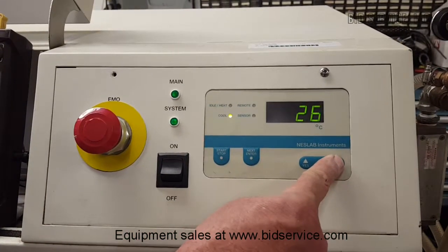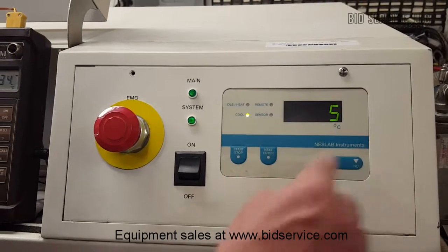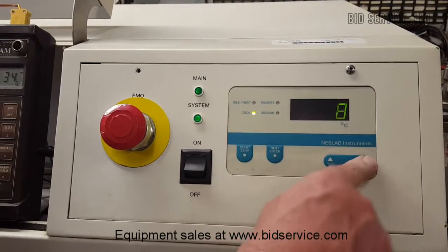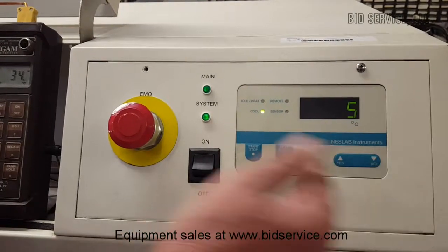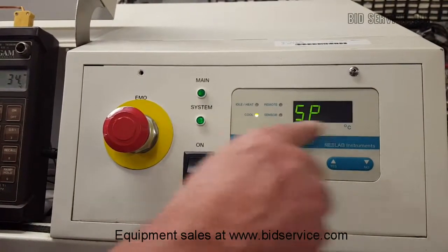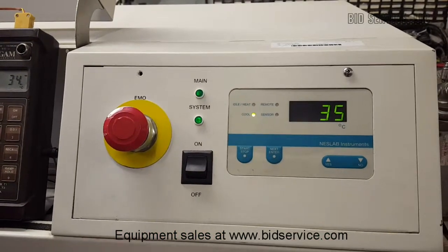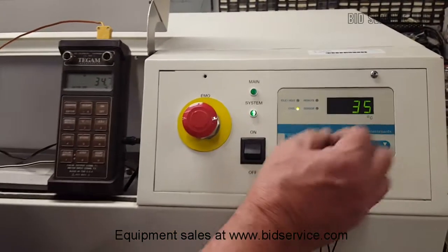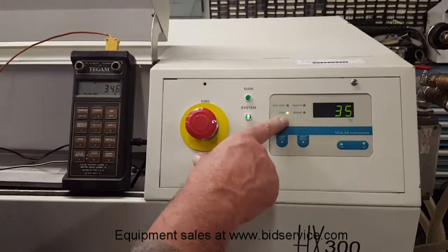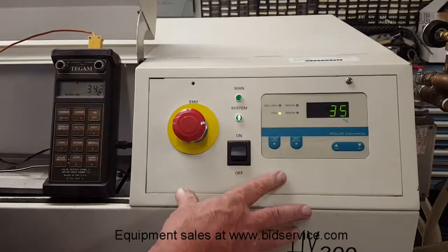I am going to bring that down to 5. As you can see you can just hold it or step through it one by one. 5 is the lowest, and once you have selected that I hit enter and it says SP5, and I am going to confirm it and hit enter again. At this point the set point is set to 5 degrees and you can see our cool light has stopped flashing — we are now in full cool.